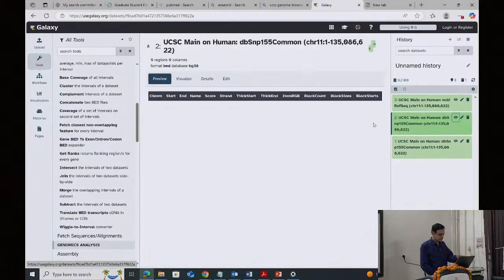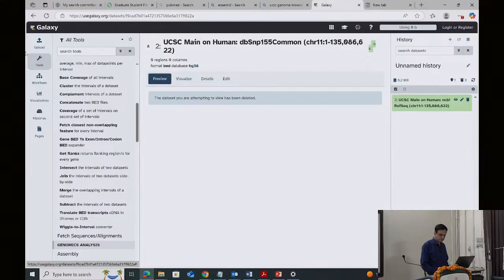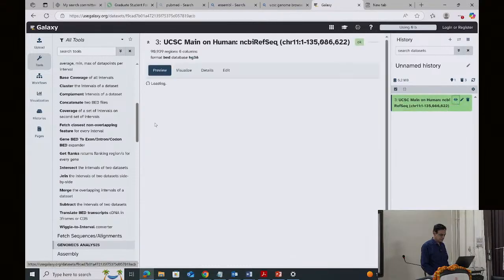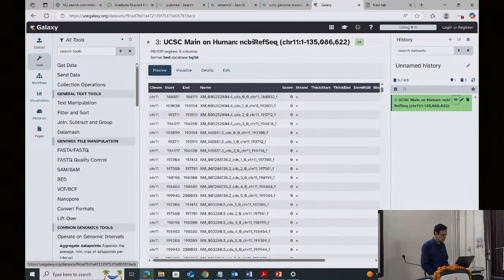Okay, maybe there is some problem. So I will delete all this. I will go back actually. There is time. So we have, okay, this is good, the coding exons. We'll go back to UCSC browser again.